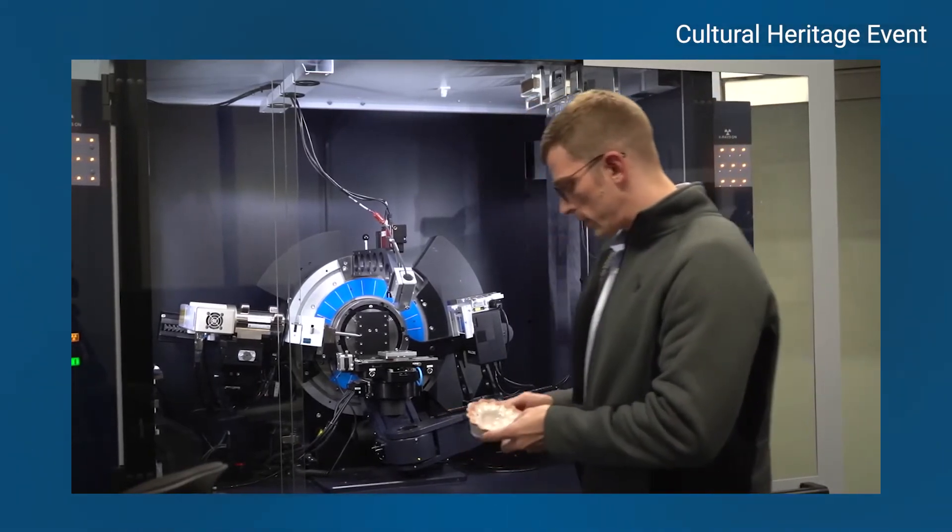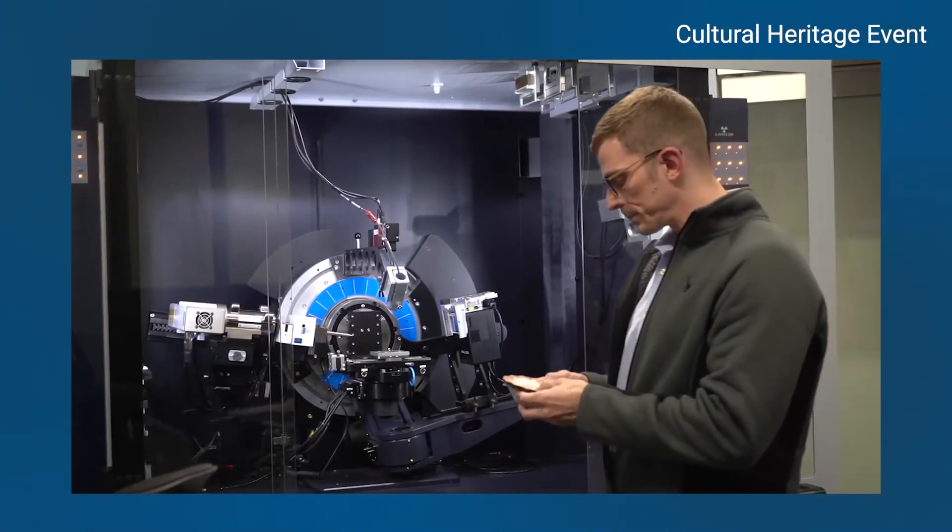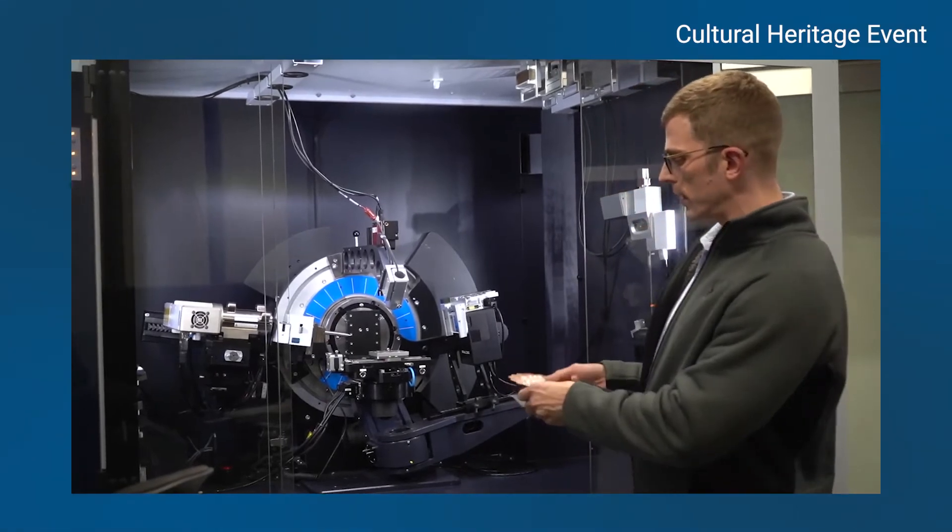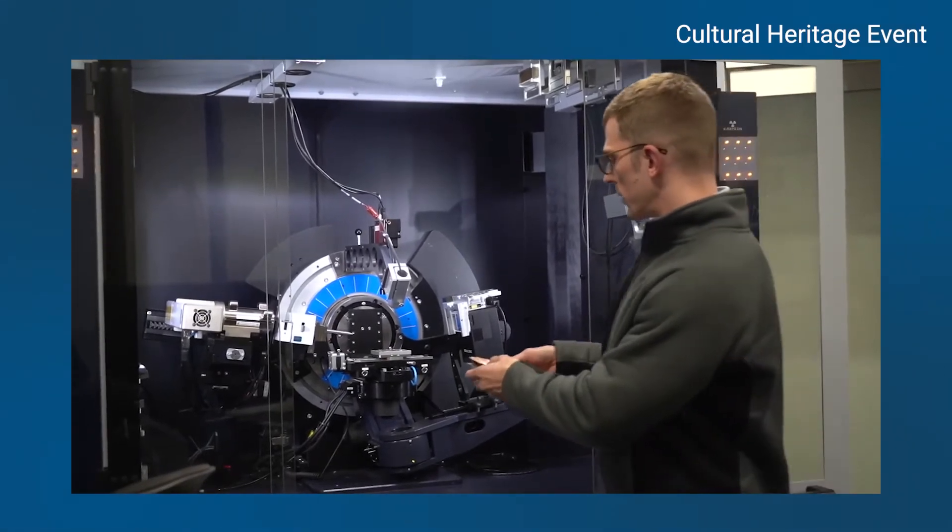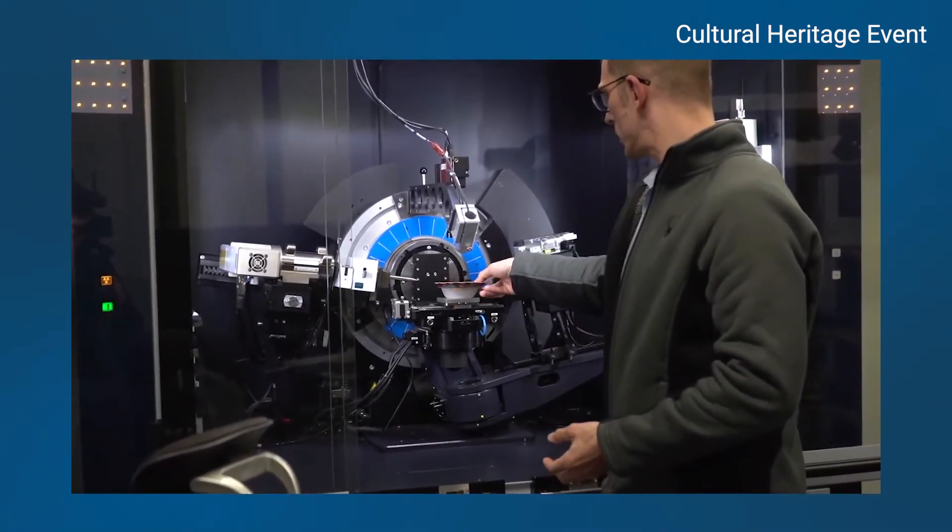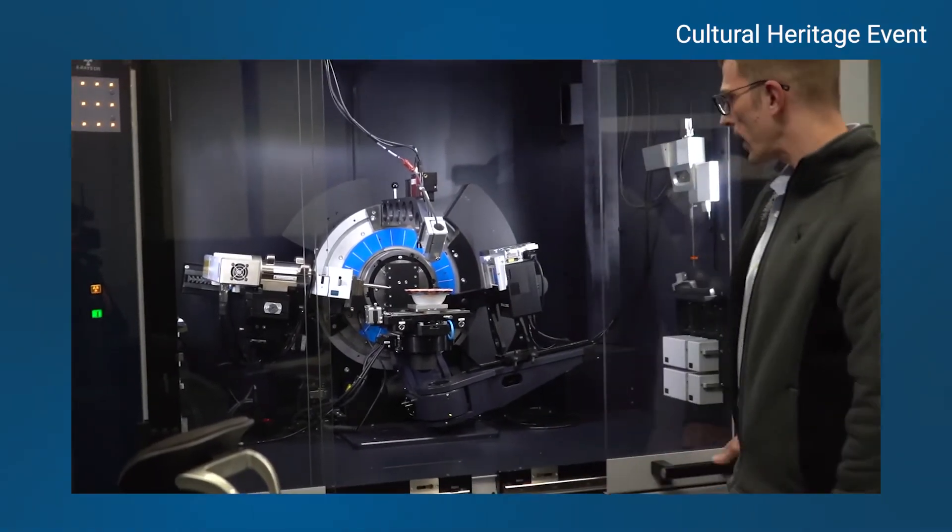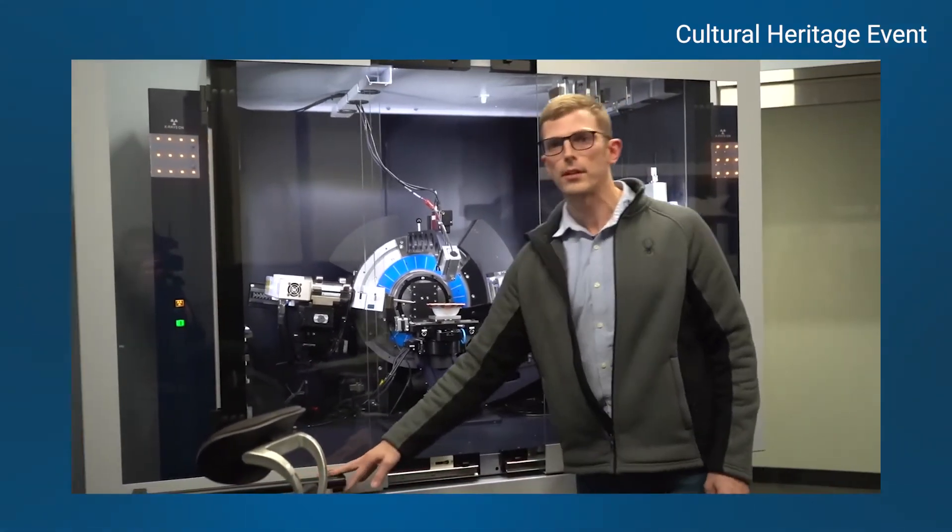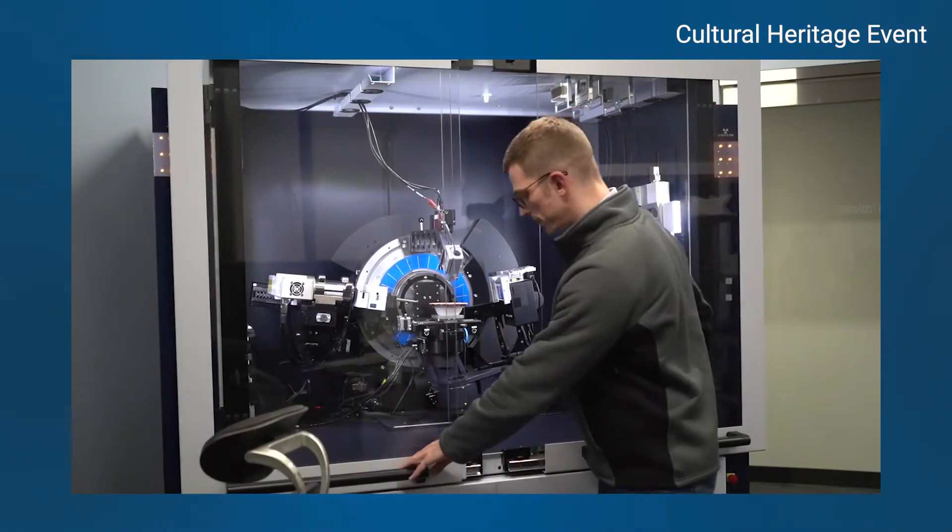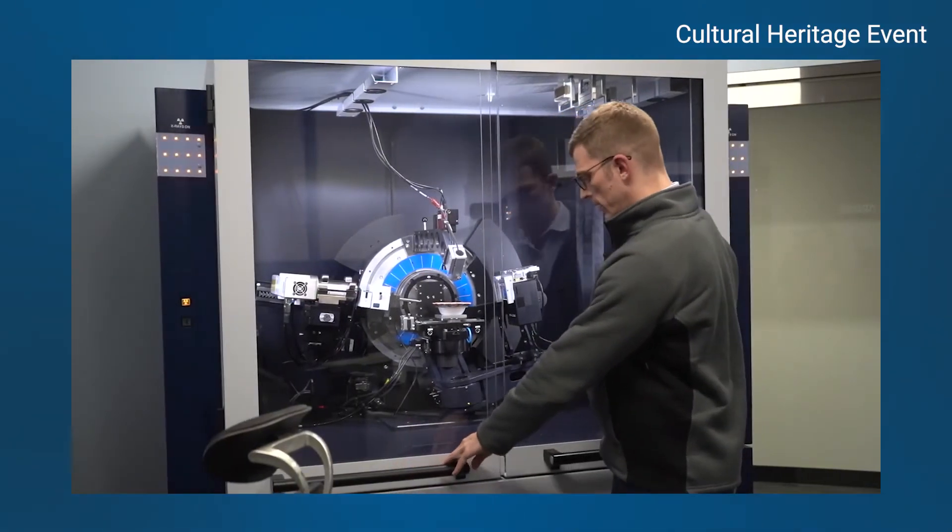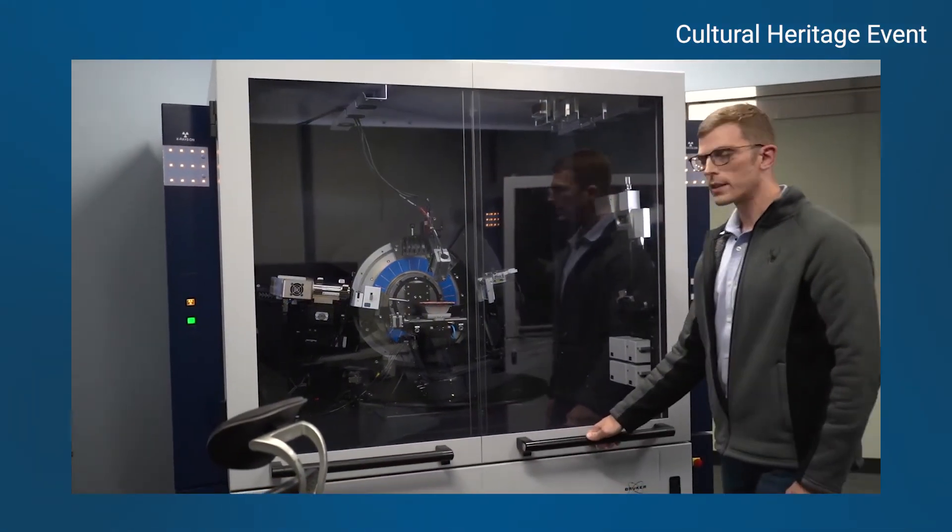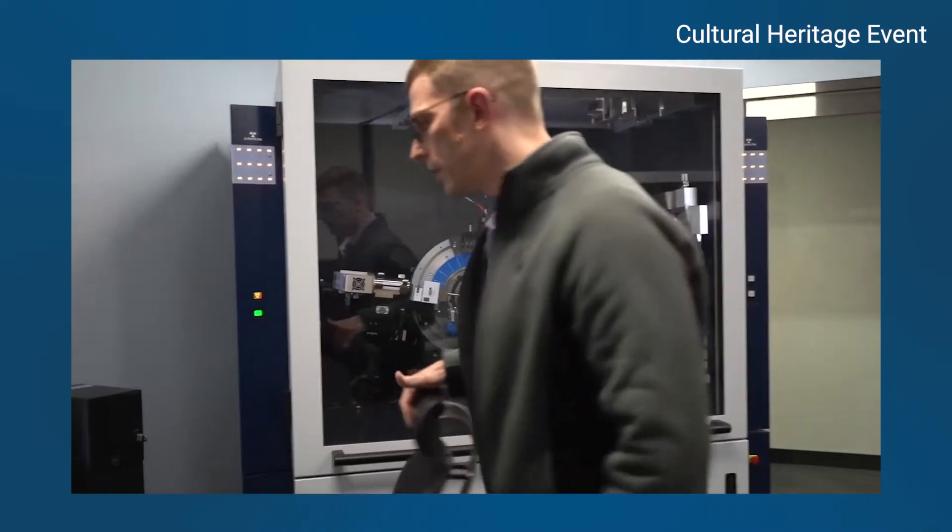To mount it on the instrument, I'm not going to do anything special. I just have something to stabilize it, and then I'm just going to set it down here and trust the stage and the camera to help position it more precisely. So the sample's on the instrument, and I'm going to go over to the computer.